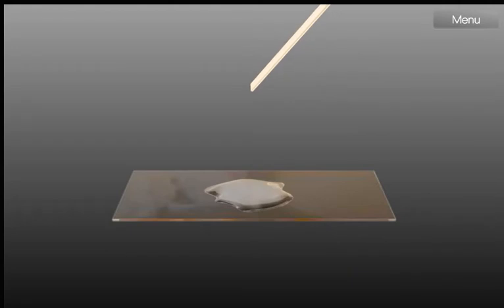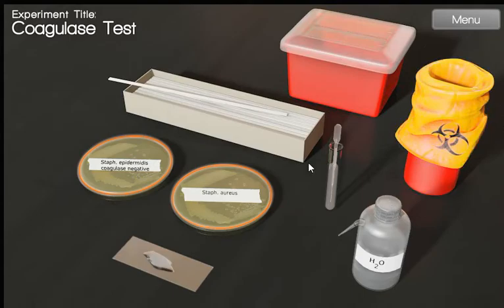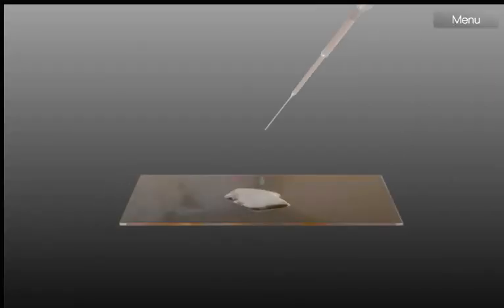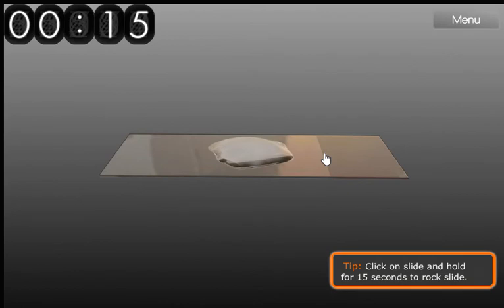We prepare the bacterial suspension. After that, we add rabbit plasma and hold and rock the slide for 15 seconds.